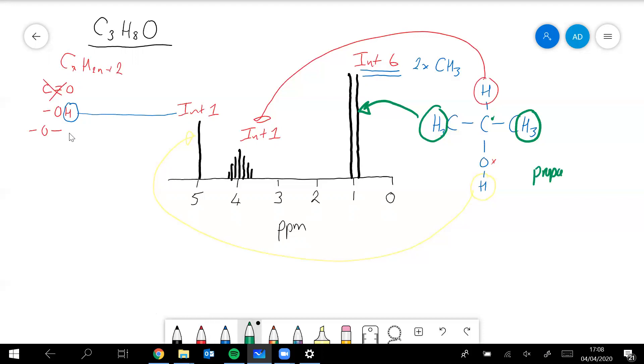Let's just have a little look. The only other thing it could have been I suppose is propan-1-ol. Let's just have a look at what the spectrum for propan-1-ol, we'll try and predict what that would look like.